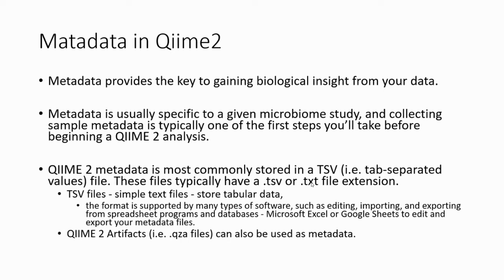That's the metadata, because when you do the programming, the processes will all refer to this metadata so that they can process the analysis. And later on, you will see a lot of .qza files during the analysis. These are QIIME 2 artifacts, the files produced through the QIIME 2 analysis.